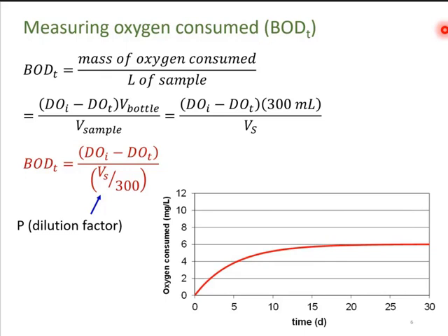And look, as time goes on, what happens? The dissolved oxygen at time t drops and drops and drops as the bacteria consume it. And so the BOD_t climbs over time. So this distance here is what we're measuring in the test, and we're calling it BOD at time t.